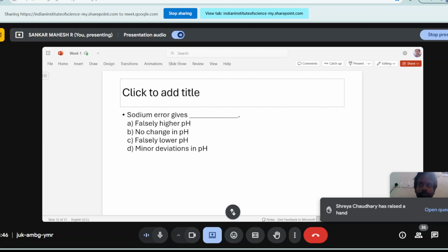Sir, I think NaOH and something. Right. You either add NaOH or KOH, depending on the salt that you have in your buffer. This is how you introduce sodium in the first case. NaOH shifts your pH from whatever it is to more basic, which is beyond 8. That is when you have sodium ions. And because pH is measured in negative log terms, there is an exponential decrease in hydrogen ions as your pH increases beyond 8 or so. That is when you first introduce sodium ions.